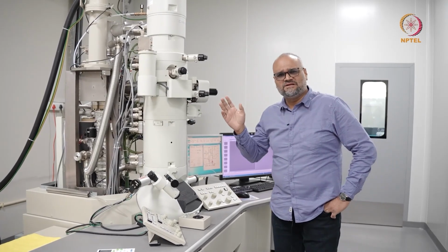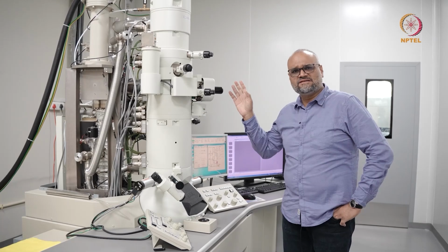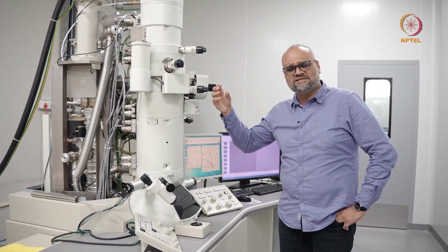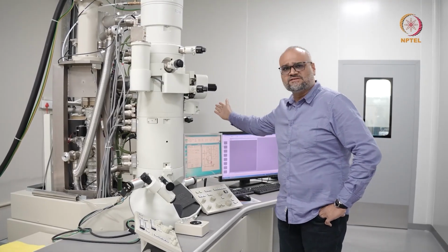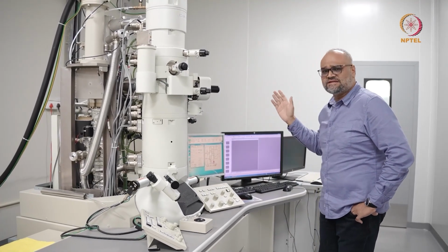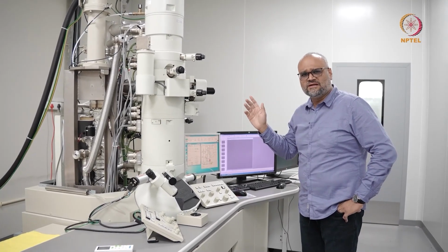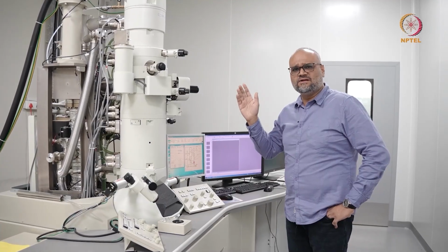And with the power situation in India, we generally have an uninterrupted power supply. So the raw power goes through our UPS and then to the step-down transformer. And from the step-down transformer, we power on the electric console. And once you check that everything is in order with regard to the power and the vacuum and so on, you are good to go and start loading a holder into the microscope.